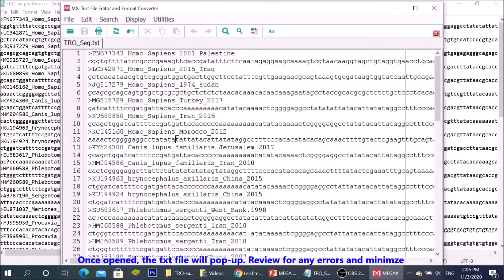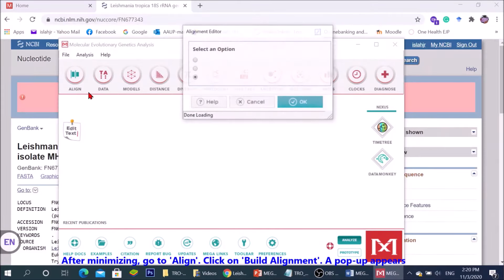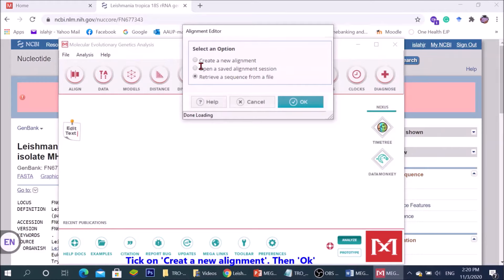Once opened, the TXT file will pop up. Review for any errors and minimize. After minimizing, go to align, click on build alignment. A popup appears. Click on create new alignment, then OK.